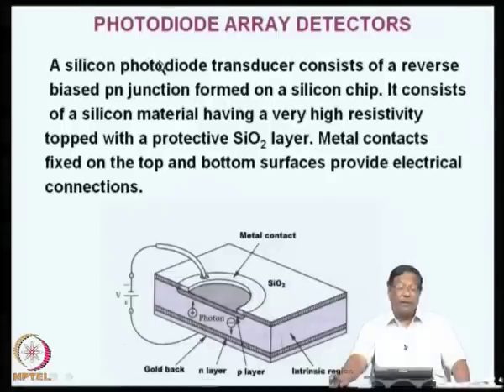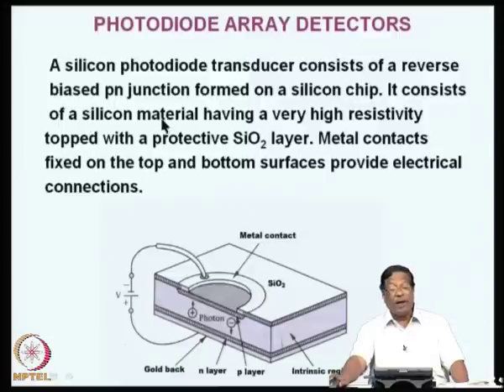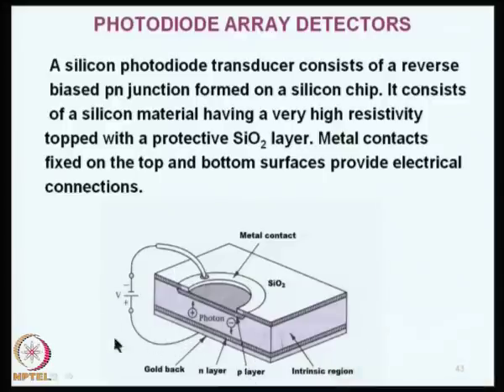So, nowadays there are photodiode array detectors. These are nothing but a silicon photodiode transducer consisting of a reverse biased PN junction, and that is formed on a silicon chip. It consists of a silicon material having a very high resistivity topped with a protective SiO2 layer. So, metal contacts are fixed here. You can see a metal contact is here, another metal contact is here, and then this is the intrinsic region. There is an N layer and there is a P layer. This is the gold coated back. So, the bottom surface provides electrical connections.